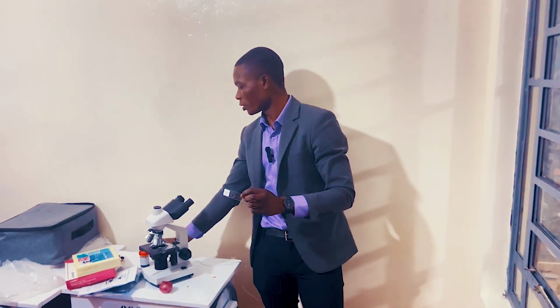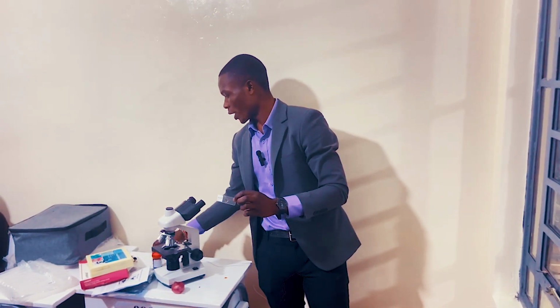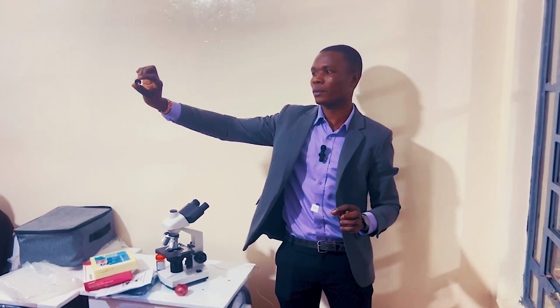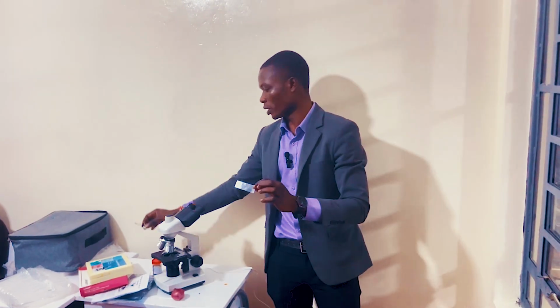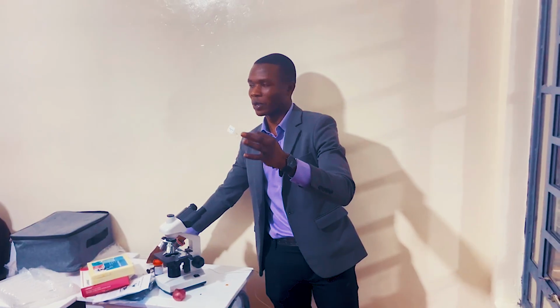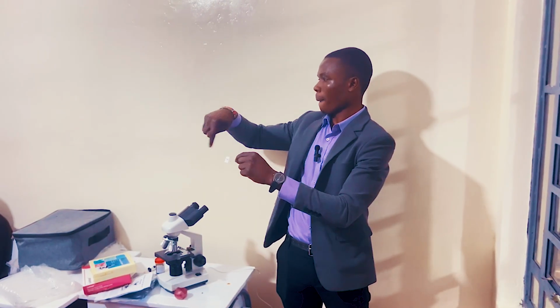We added drops, so you cannot come and start pouring this one. We have something called a dropper. As you're adding drops, you use a dropper to add the drops of iodine solution. Remember, as you stain it, this is liquid, right? It's going to spread on this slide.